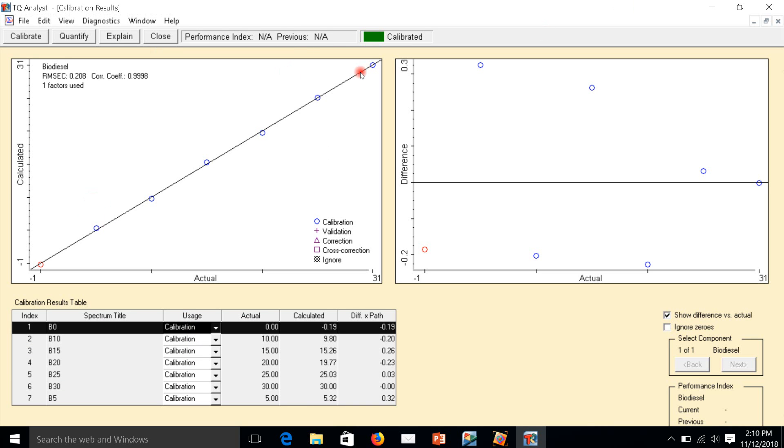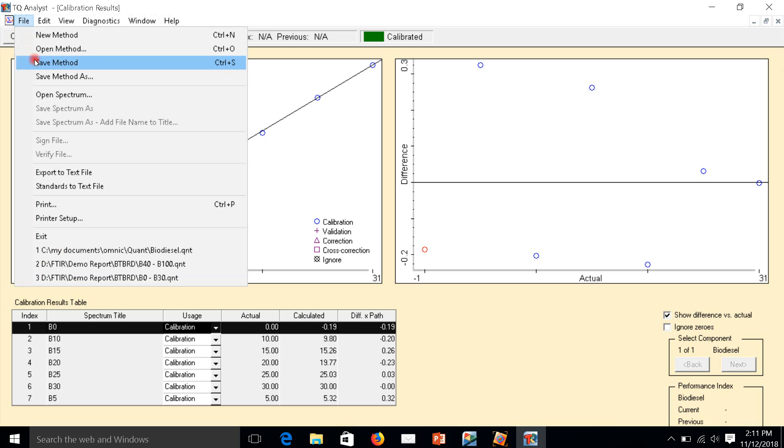This one is the calibration curve, and this one is root mean square error. This one is the correlation coefficient. It's a very nice calibration curve. Next step is we have to save the method.